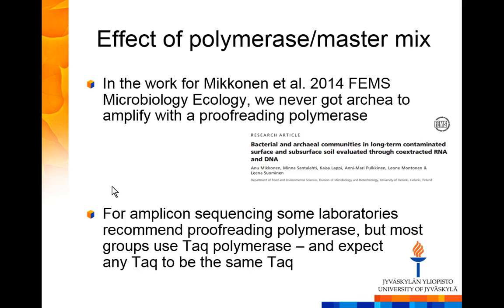Another thing, the polymerase or master mix. In one of our earlier works, we wanted to recover bacterial and archaeal communities from the very same samples, based on both RNA and DNA, and then make comparisons.